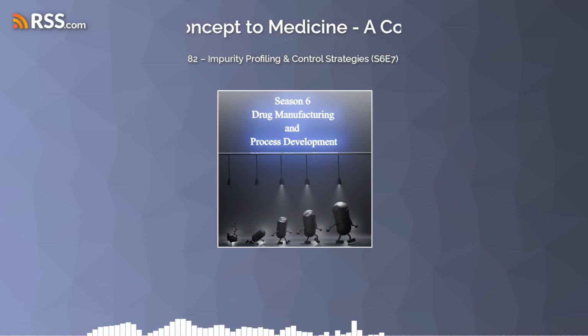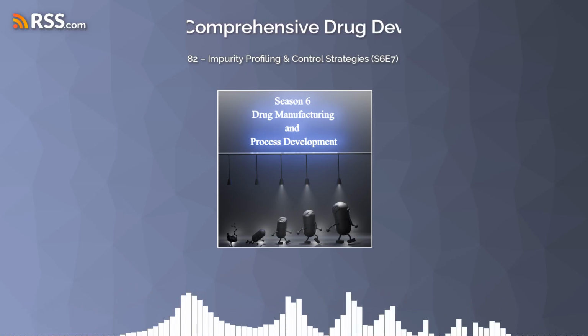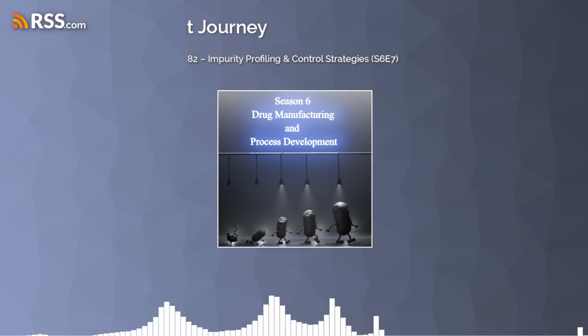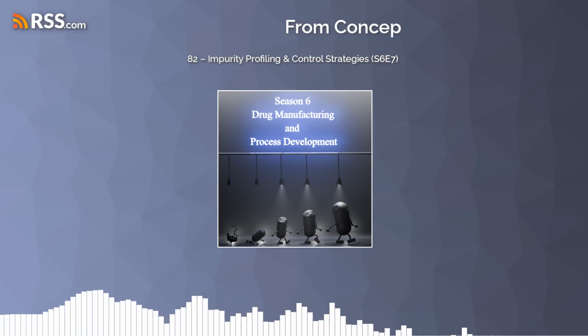Yeah, it's pretty amazing. So what are the tools? What are they using? Well, one that popped up a bunch in what you sent, especially when they were talking about chiral drugs, was HPLC, high-performance liquid chromatography. Sounds intimidating, but super precise. From what I read, it's like the ultimate sorting machine.